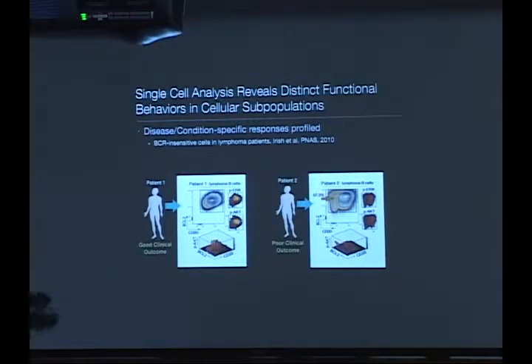So the objective here is really to find these cell subsets that tell us something about this external question we have. We want to find these cell subsets that tell us about how our patients are going to do, our patients' phenotypes. And really, often the experimental challenge is for you to identify those cells in the first place.